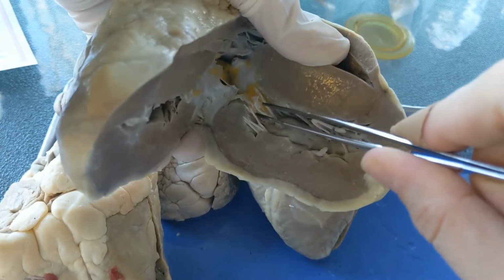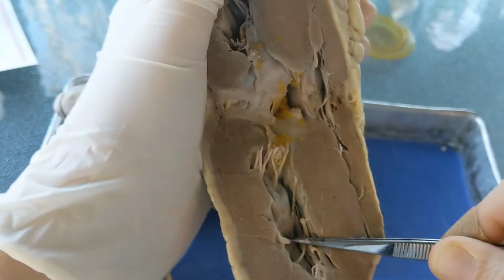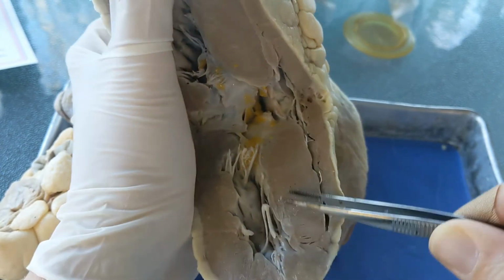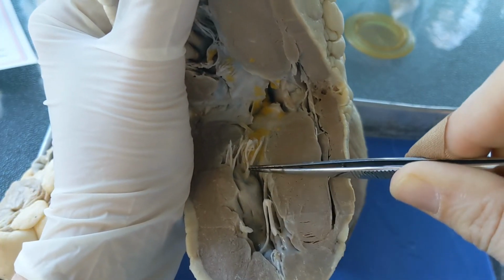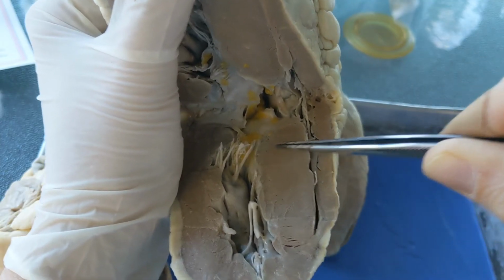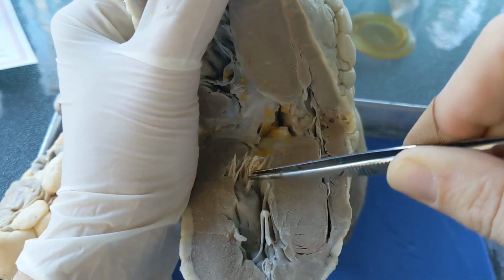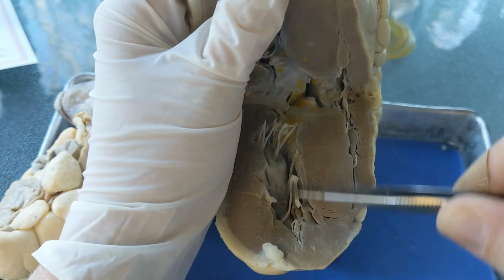Can you tell? Okay, so you check out the valves, see if there's anything strange about these valves, such as disgusting discoloration. Note which valve. So you should know which side of the heart we're on here, the bigger side. What is the valve that separates the atrium from the ventricle on the left side of the heart? That's where I am seeing most of this, looks like on the left side in that atrioventricular valve. So you should definitely know which valve that is. If you're not sure, figure out which one's between the left atrium and the left ventricle.